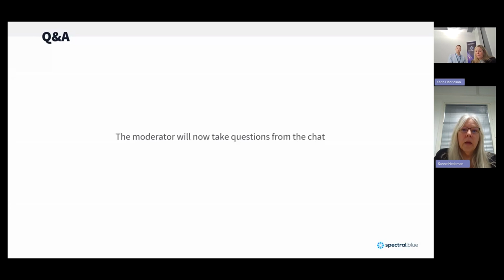Yeah. And so maybe one of the last questions here: is there a way to verify the effectiveness after some time of using the blue light? And how would you know if it's not working properly? Yes, well, you can use the same microbial sampling methods as with any other disinfection procedure. So you can take swabs or you can use contact plates.